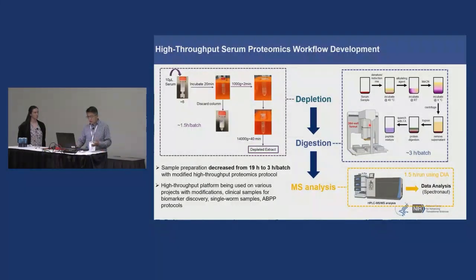We also tried to adapt this system to multicellular samples, for example worm samples, C. elegans samples, because of the challenge of protein extraction through the thick cuticle of C. elegans. So we got to know Covaris and the R230 systems, and more importantly we have Valentin here, a very talented scientist, who will continue the story with you. Okay.